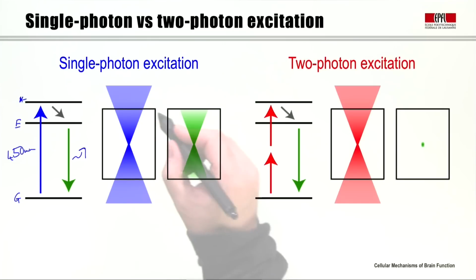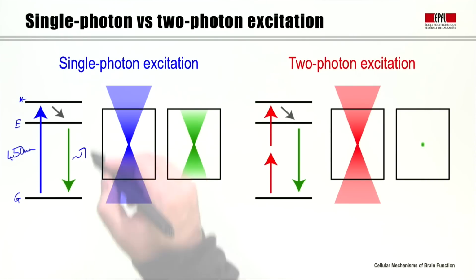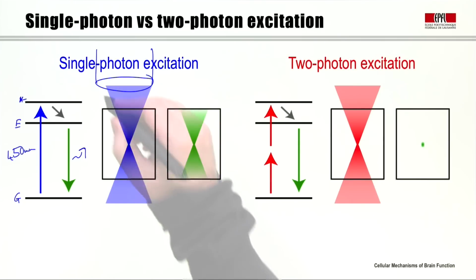And if we now imagine having a cuvette filled with a fluorescent dye in the solution, and we put blue light in again through our objective, we focus it in.